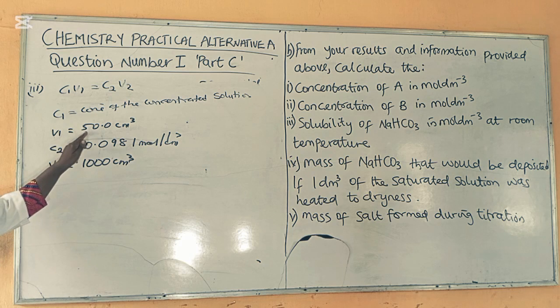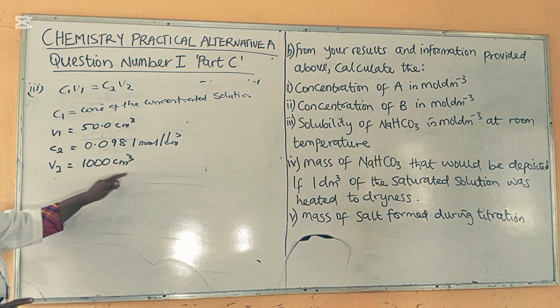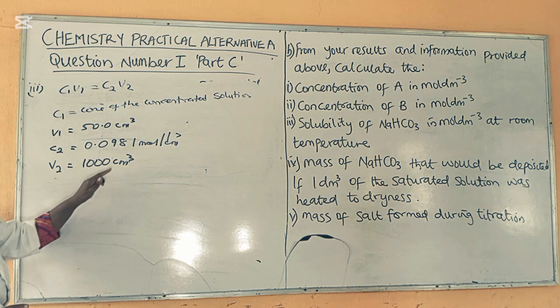Remember, you took 50 from the saturated solution and made it up to 1000 with distilled water.